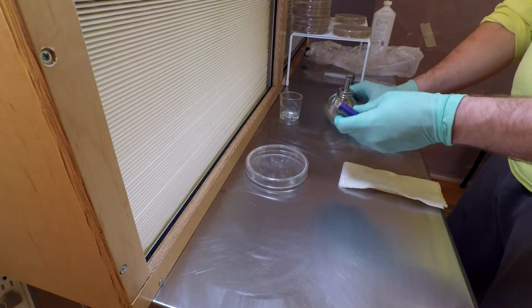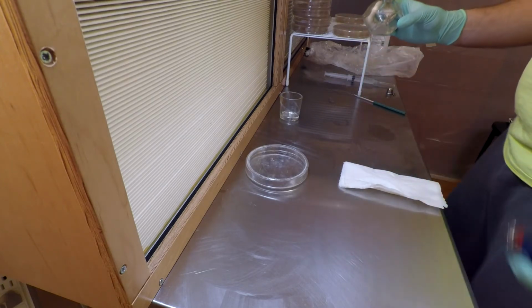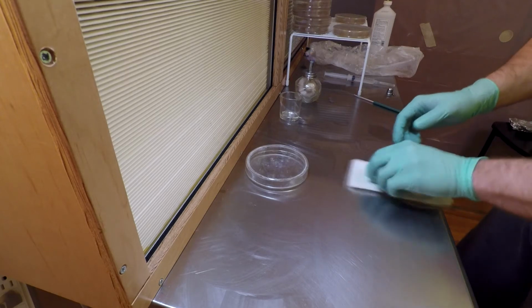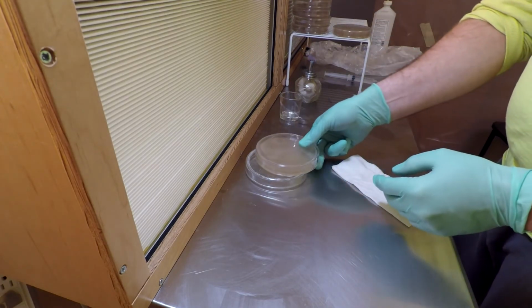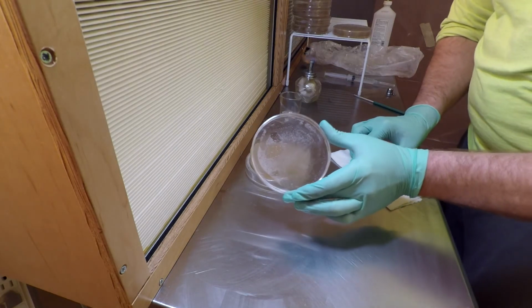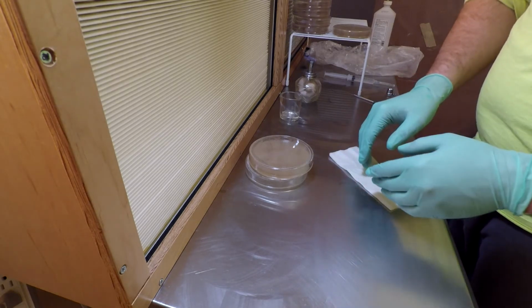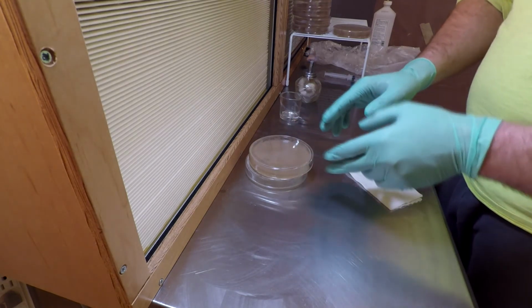Remember to always respect fire. Make sure any excess alcohol is evaporated off of there before you cause a disaster. Alright. Start off with this first dish over here. Now, you can still see there's some light condensation on the dish. And I do see some light condensation on the agar itself. Hopefully as it sits in the warm room, because this section of the room, because I have it boarded off with plastic, doesn't get as warm, once the surrounding air is warmed up, all that condensation is going to dissipate. But I think it's low enough levels now that it's not going to be an issue.